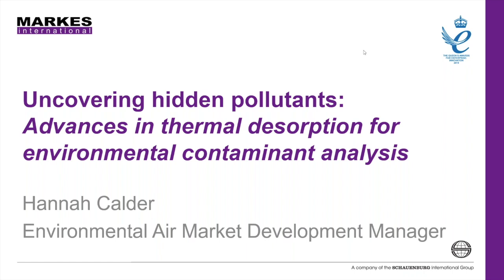Thanks very much, Lauren. As Lauren just outlined, in this presentation today we're going to be looking at how thermal desorption combined with GCMS is able to respond to the changing demands of regulated monitoring in air, and how thermal desorption is being used in cutting-edge research to aid the understanding of these emerging compounds and look at their effects on human health. I'll be showing short application overviews today and hope to showcase the versatility of the instrumentation for environmental monitoring.